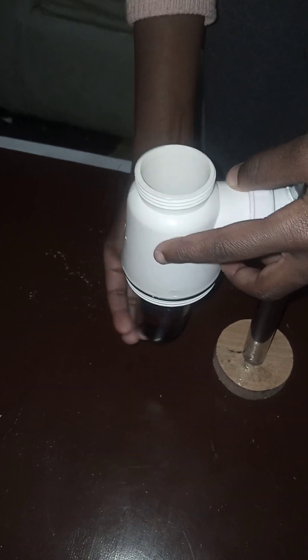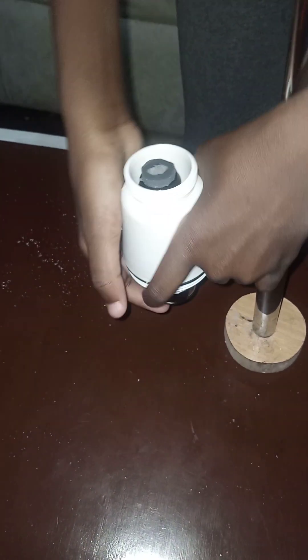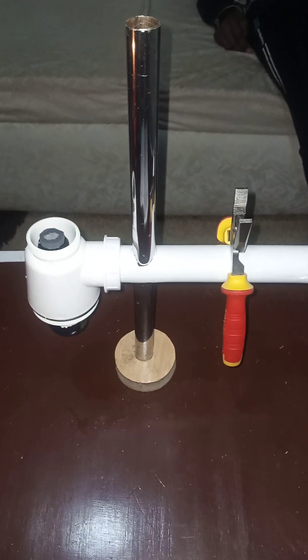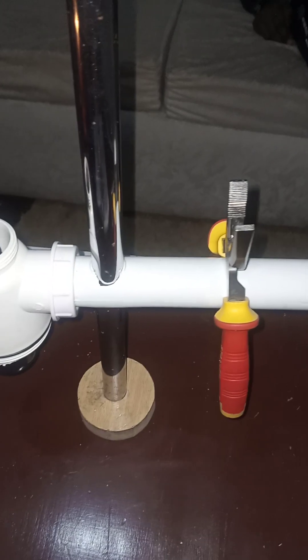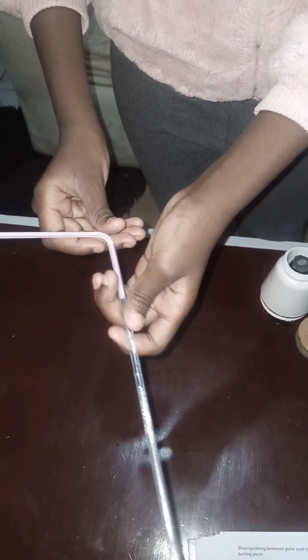Next we are going to assemble the retort stand to the holding arm up to the required height. We are going to take our boiling tube and put it into the holding stand. Push it inside — push it a little bit harder. Here now we have our retort stand connected to the connecting arm and onto our boiling tube. This pliers here is just used to balance it so it does not tilt over.